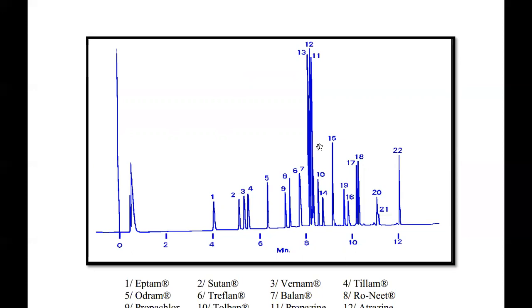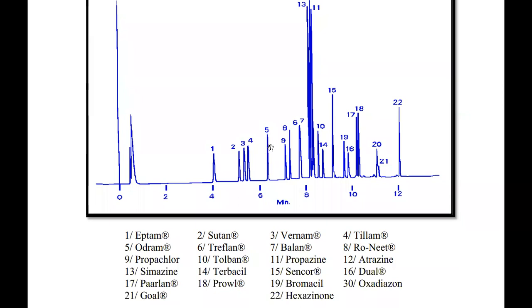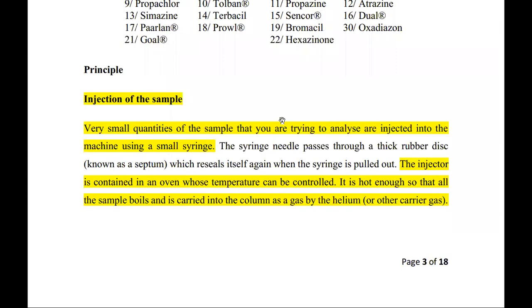But remember, at times the solvent you are using, the solvent, not the mobile phase, the solvent. Remember, the mobile phase is an inert gas, but at times the solvent used is able to reach the detector, and you can see this one here. You're able to tell that this peak, I think, is that of the solvent. So all these things have to guide you when you're in the lab on how to interpret the peaks. The peaks are somehow similar to those of the mass spectroscopy method.